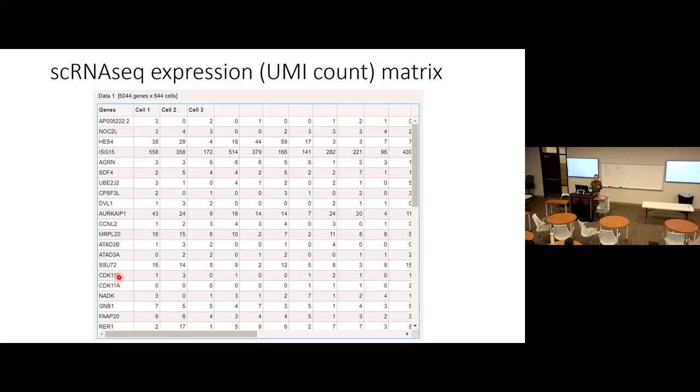It's a comprehensive, summarized effect. For example, we can summarize all 6,000 genes' expression pattern into 50 vectors. So you compress 6,000 into 50 vectors to represent the major components among the explaining variable patterns.